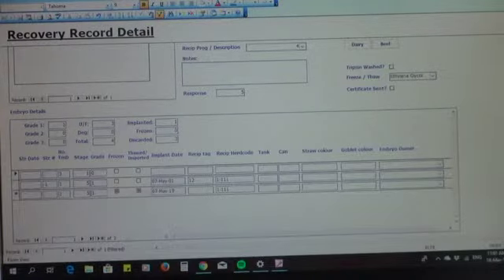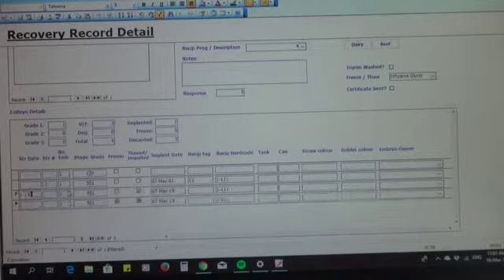There was also another embryo. This is my code 19MY07. So that tells us this should be automatic. It tells us this is basically the date backwards, so it's the 7th of May 2019. And this is an internationally recognised format for this. And we can call it embryo number 2. There was another embryo here that we froze, so it's not implanted.